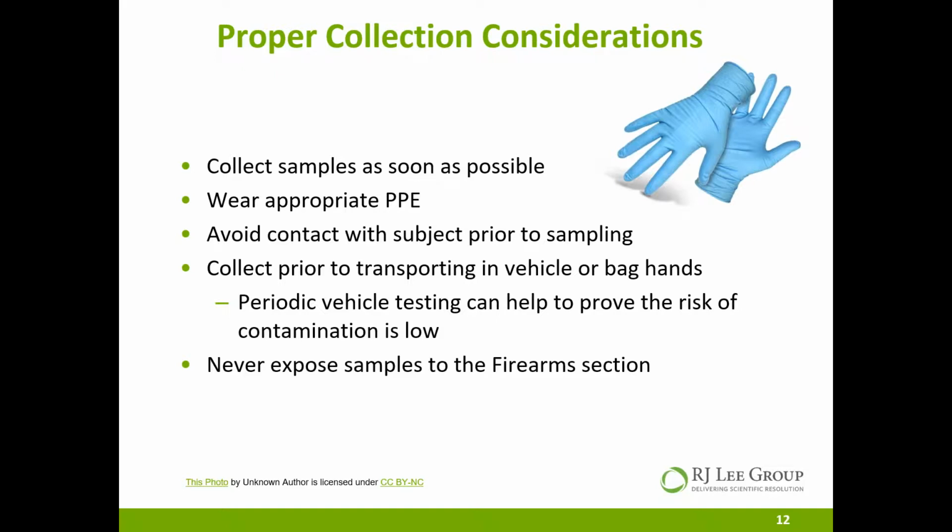This is a very important step. It will no doubt come up during testimony, and whenever we're discussing potential contamination issues, it will help us a lot if we can say that the collecting individual had gloves on, the proper PPE.